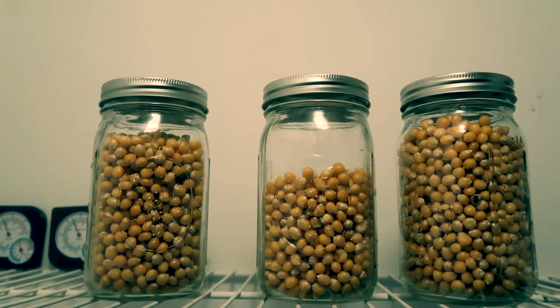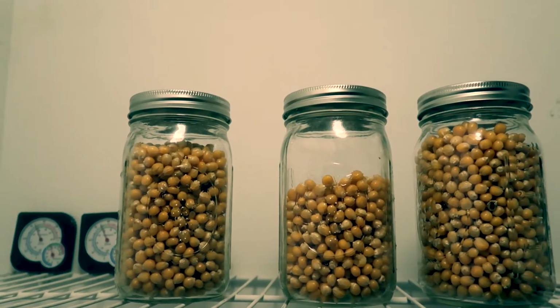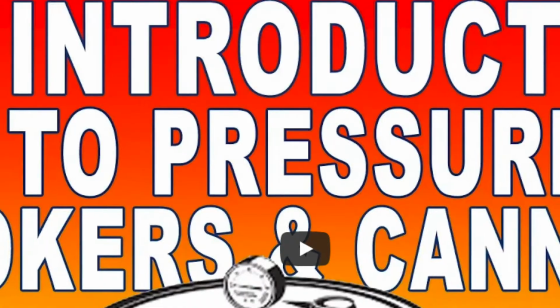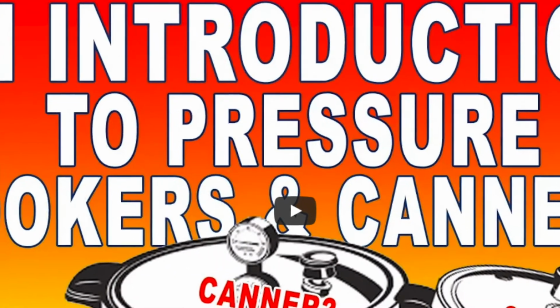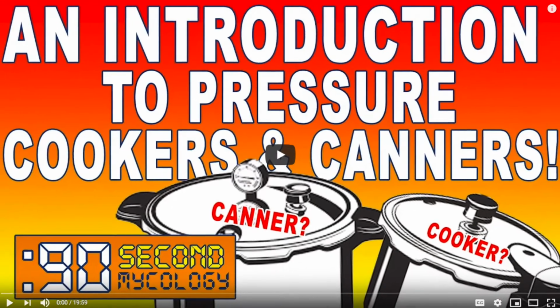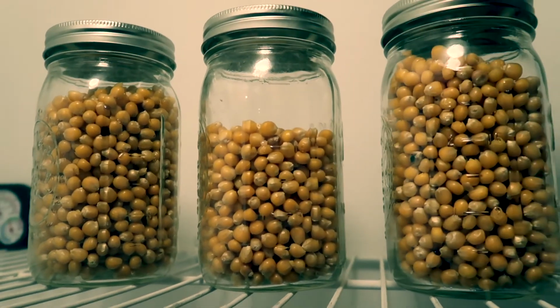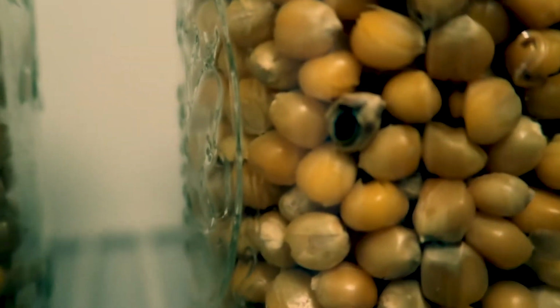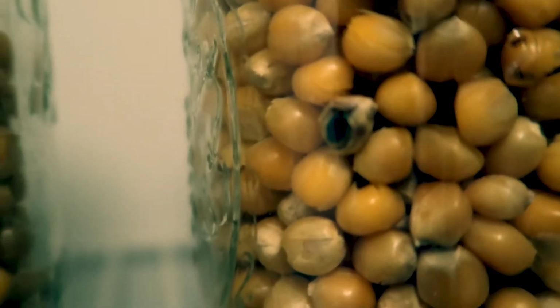If you want to speed the process up, then you definitely want to look into getting a pressure canner. I have a video on this channel which is an introduction to pressure cookers and pressure canners. Even though the names are used interchangeably, there is a difference between the two appliances. So if that's something you're interested in, go ahead and check that video out. Don't be worried about this right here. That's just one of the burnt grains from when we were starting to boil the grains up.